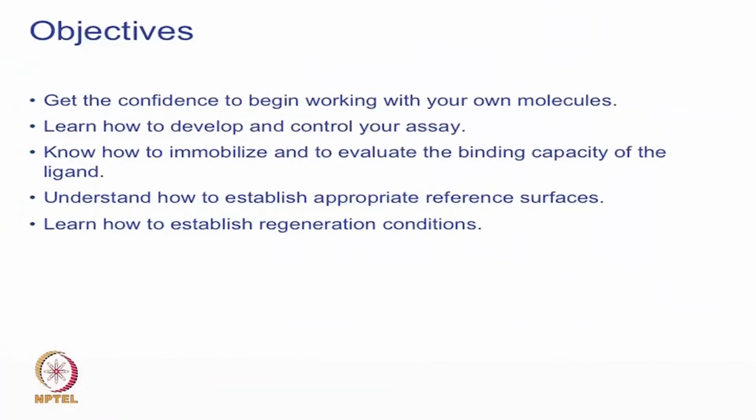In this session, we will understand how we can develop an assay, Biacore or a surface plasmon assay. The objective of this particular study is to understand how to work with the molecule, how to develop an assay, control an assay, and we will understand about the reference surfaces. We will also understand about the regeneration of the surfaces and all that.